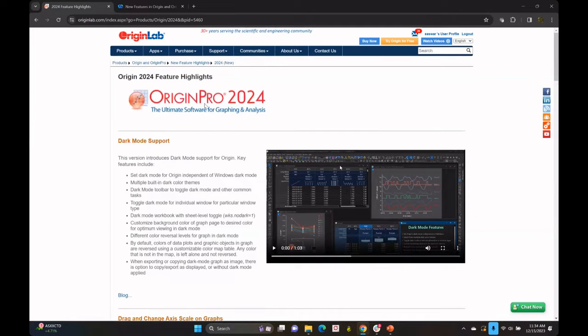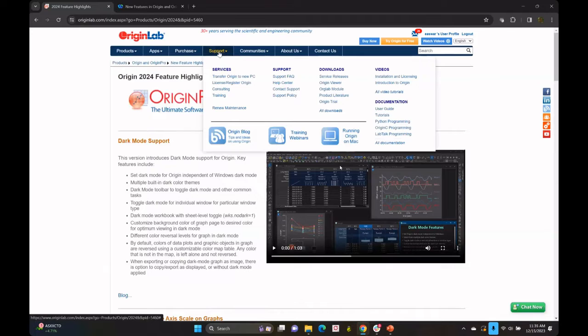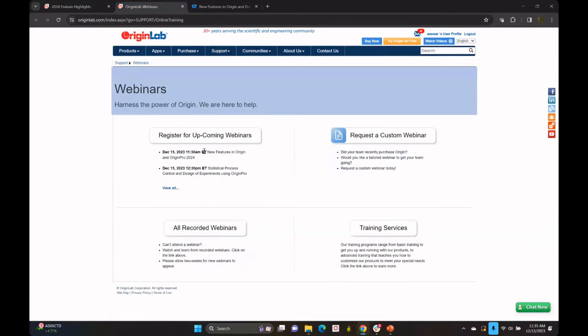Before I do that, I also want to give a shout out to the next webinar. If you go to the support menu, you will see there's a training webinar page. If I open that, you will find upcoming webinars listed here. After this webinar on new features, there will be another one today at 12:30 by my colleague Yiming Chen. This second webinar will focus on statistical process control and design of experiment apps that we have added for OriginPro. So please feel free to check out that webinar as well.